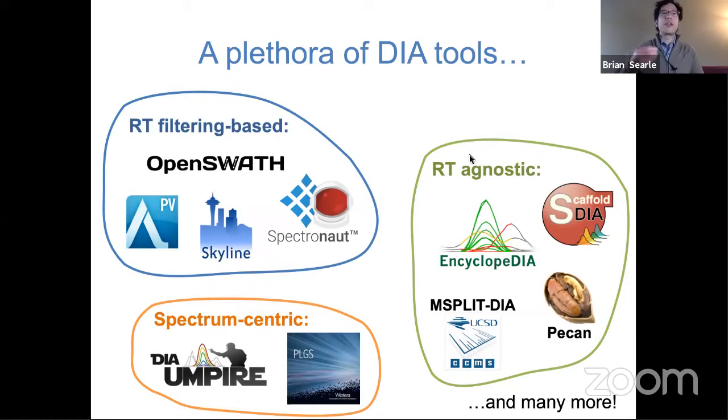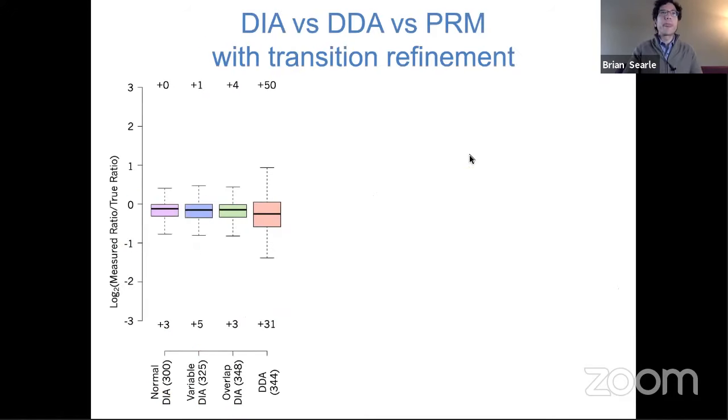But essentially trying to convert DIA data into DDA-like data to be able to process it through normal search engines that you would have for your DDA platform. So I want to finish this small segment before getting into the next bit with this idea about how accurate these types of measurements are from a quantitative perspective, because this is something that's been raised a few times.